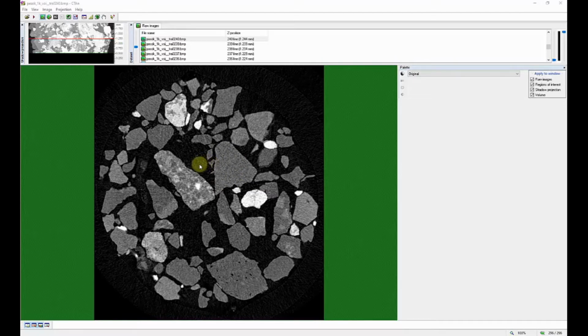So of course, in terms of how we can reduce noise, we can scan our items slower, we can add frame averaging, we can reduce our step size. Those are the ways we could set up a scan to try to prevent noise, but in this case, this is the scan data we have, so now we need to try and clean it up before we go on to the next steps of analysis.